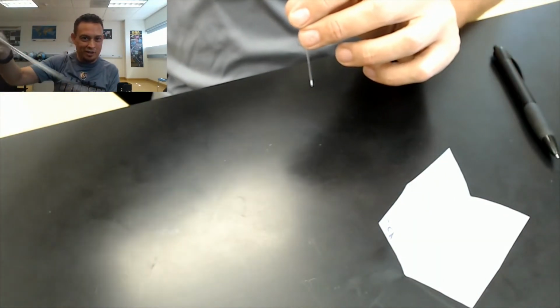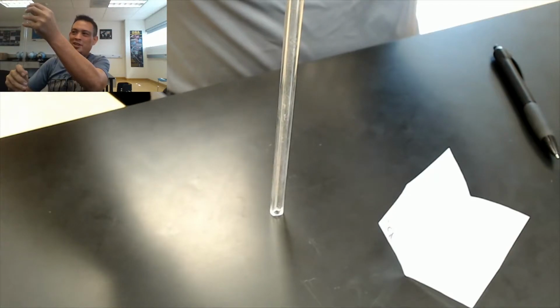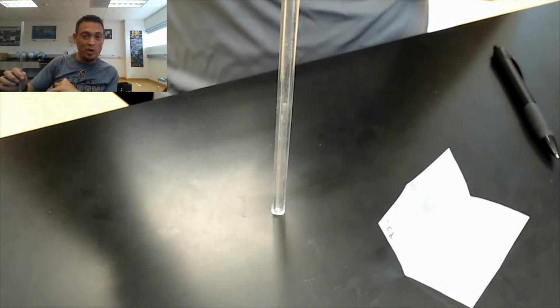So here we have just a long glass tube, and you just set it on the counter, and then you guys can see this view here. You literally just drop it into it, and then it bounces on the table. You can see it bouncing in there. And this actually works really well if you have, once again, a situation where the solid kind of sticks up in the top here.